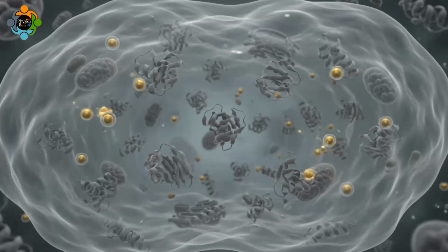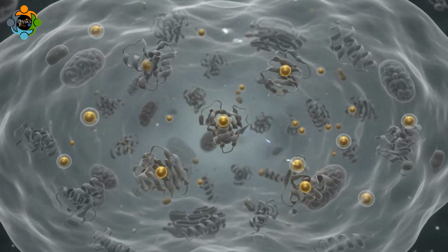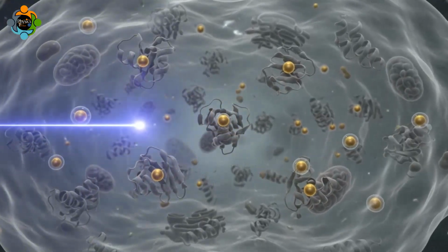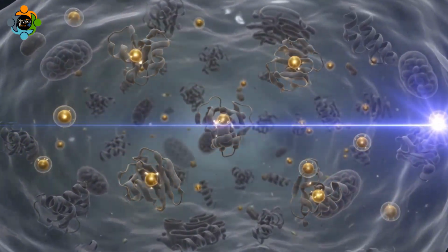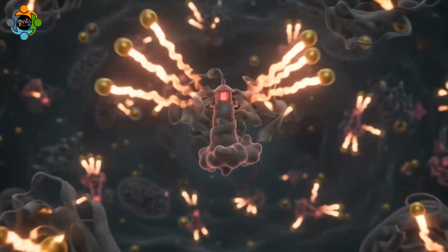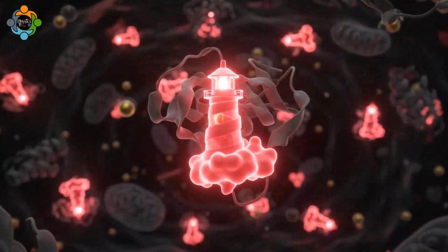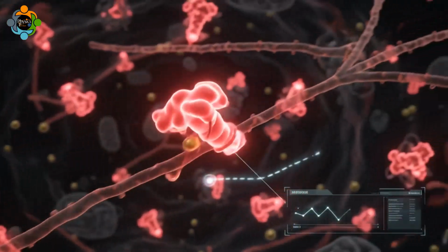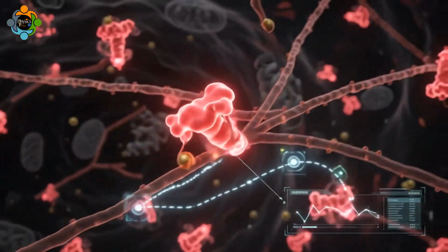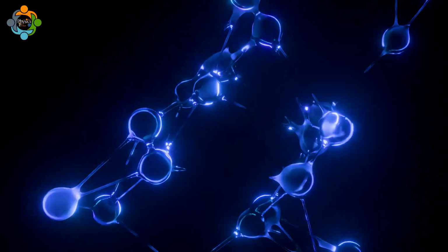Scientists attach tiny glowing tags to specific molecules inside a cell. When they shine a laser of the right color, only those tagged molecules absorb the light and re-emit it as a different color we can see. This allows researchers to watch a single protein move inside a living cell in real time, creating movies of the molecular dance of life.